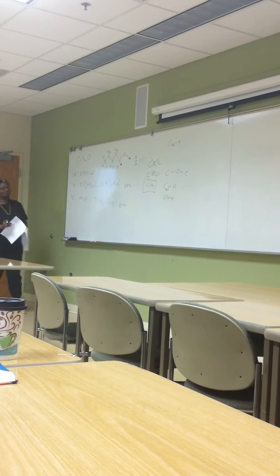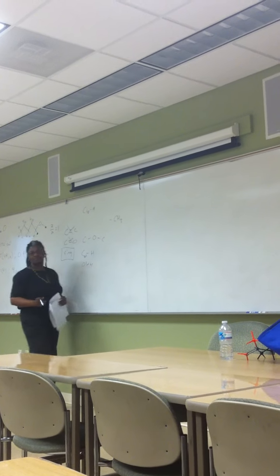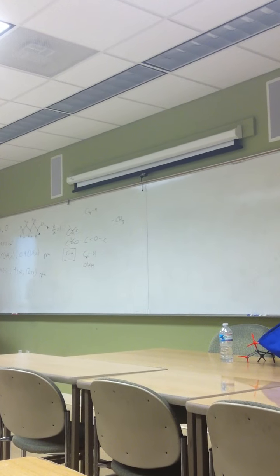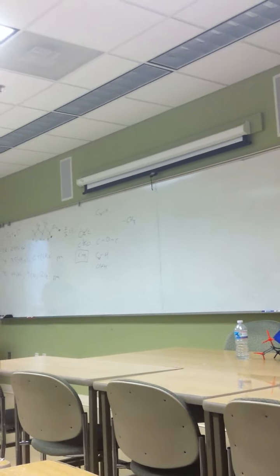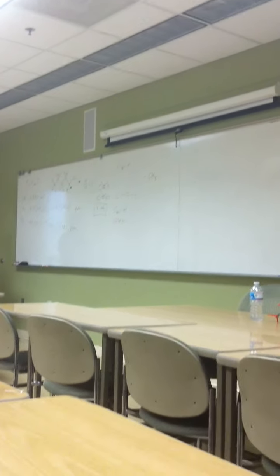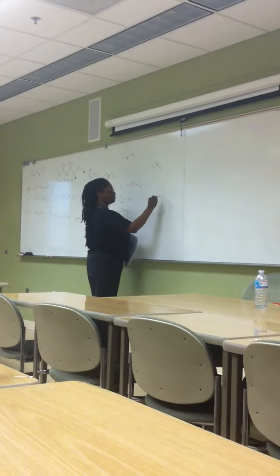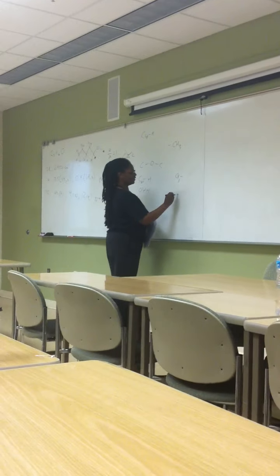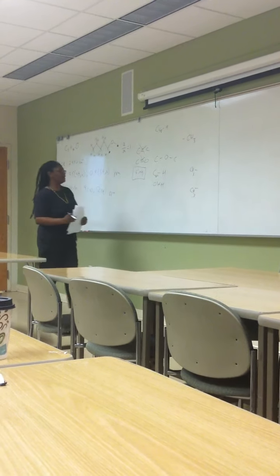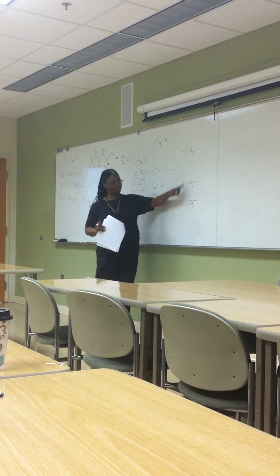Those are alkane. So if you have methyl groups, the hydrogens on methyl groups typically have shifts of less than 1. And so on this table, the expected would be 0.9 for that, if that carbon is not attached to an electronegative atom. So you get a 0.9. So now you figure, okay, I probably have 2 methyl groups somewhere on this molecule, okay? And they integrate to 6, so that means that you would have 2 equivalent methyl groups.